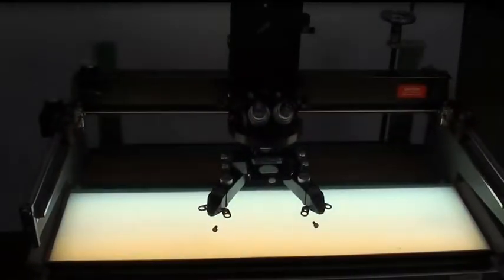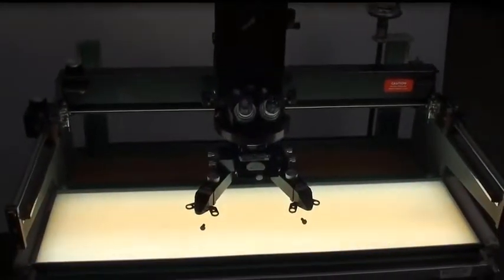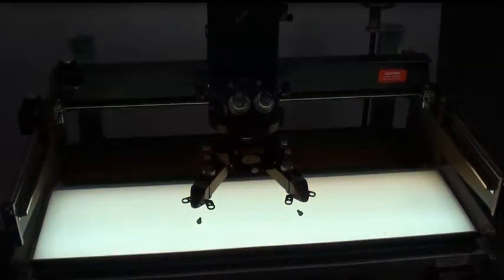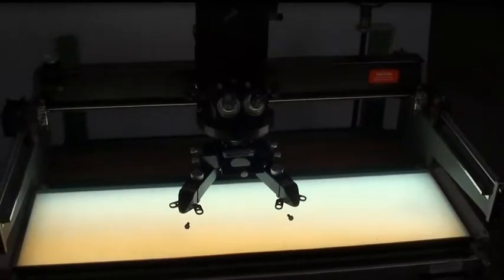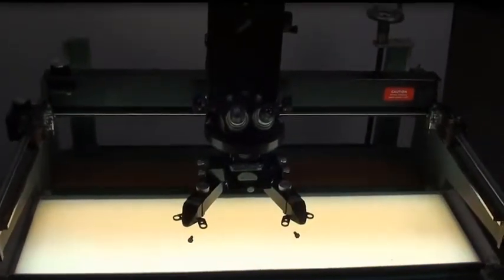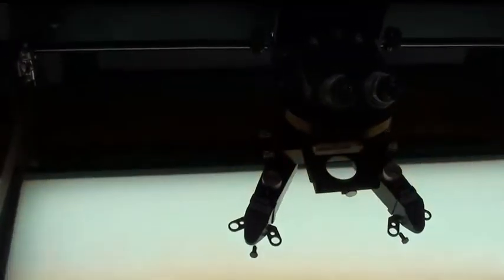Hello, today we have a Bosch & Lamm StereoZoom 240 Superposition Comparison Microscope with support in the Richards MIM 231100 light table. Everything looks to be in good working order with this microscope and table.